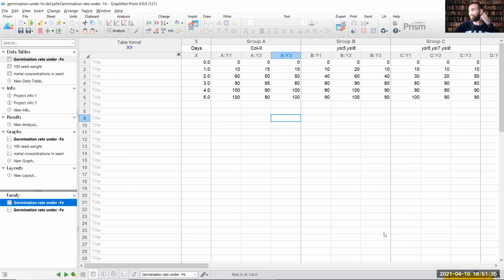And I did it. I used the data I produced years and years ago, and it worked very well. So really, I recommend you to use this software. There is a lot more. You can also do the statistical analysis in this program, which is also great. It puts the asterisks by itself, and you can then change it.